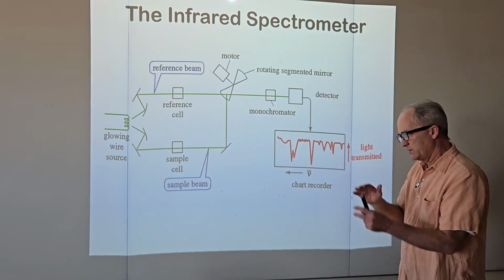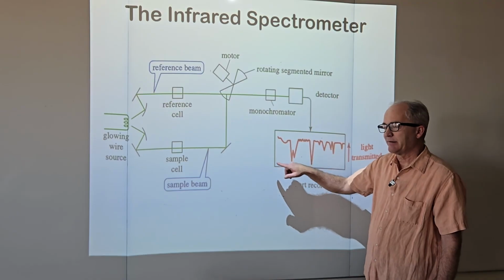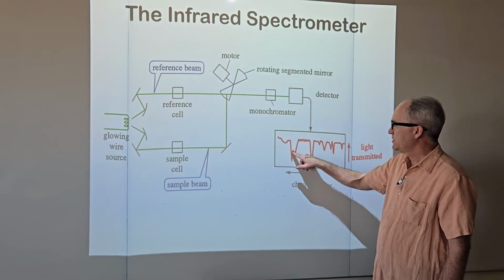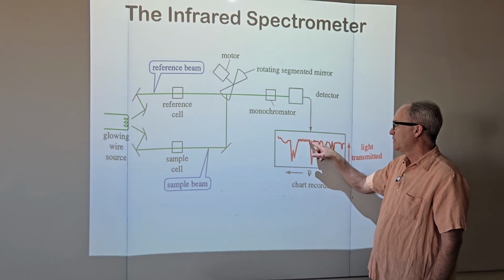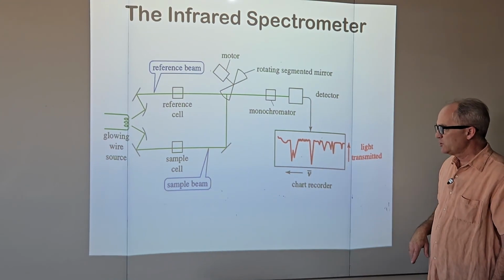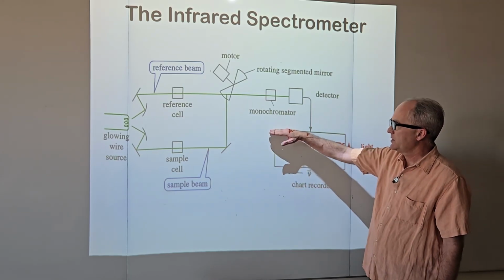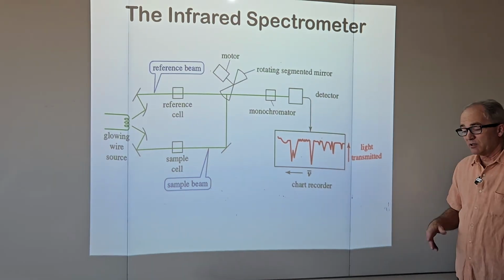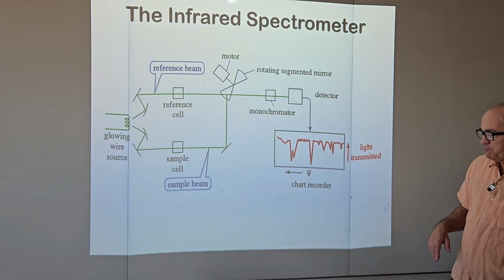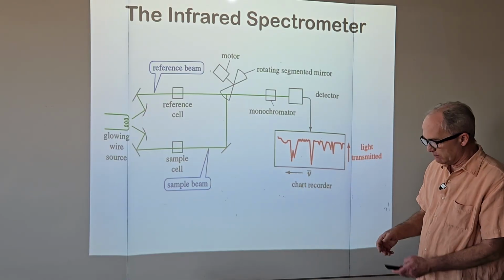Somehow we take a difference, and we get a spectrum. So these look like stalactites, and this is absorbing IR radiation. This is a transmittance, 100% transmittance, 0% transmittance. What you might have looked at in your other course was absorbance versus frequency.